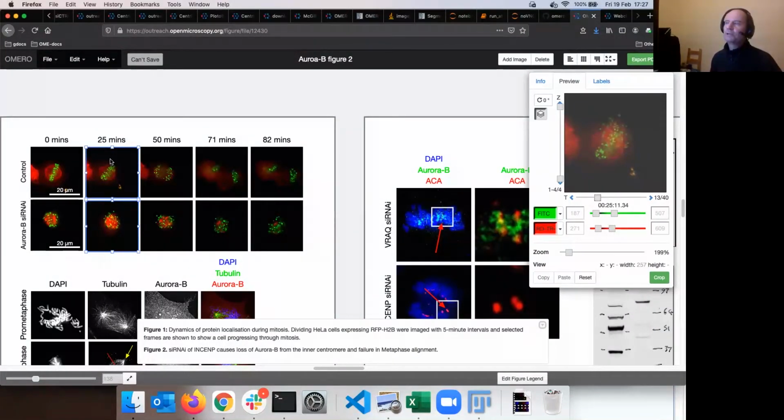The contents of those two panels changed because the T-plane of 25 minutes looks, of course, different from the 42 one, but the label was working with that. It's connected via OMERO.figure to OMERO, and OMERO knows what the delta T, the time difference between the planes, is, and how many planes I went through when I was dragging that bar. This figure was saved and doesn't even belong to me. But it doesn't matter. All is possible to fix and change on the fly as I'm coming back to that figure.